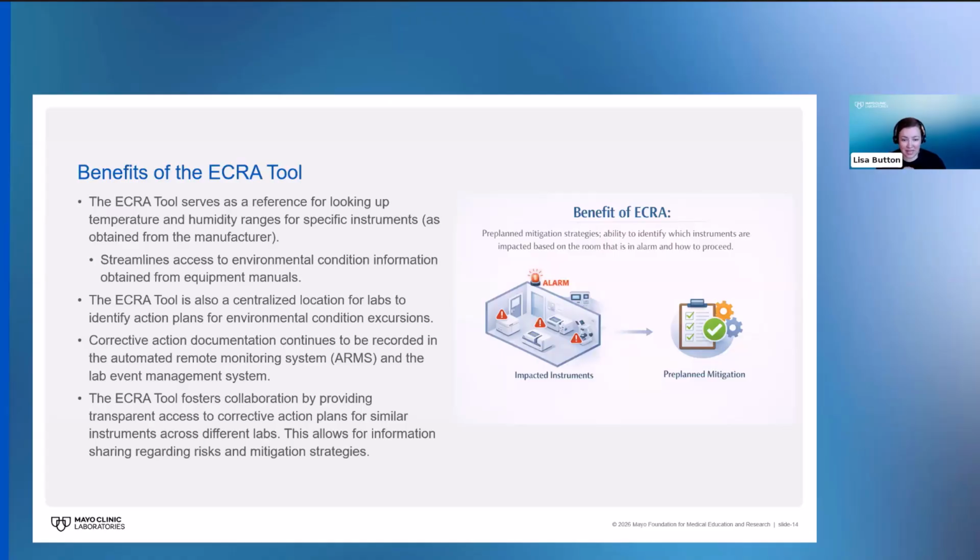And then I already mentioned the last bullet point item here, which is that the ECRA tool is fostering collaboration by providing transparent access to corrective action plans for similar instruments across different labs. And it's allowing for information sharing regarding risks and mitigation strategies.